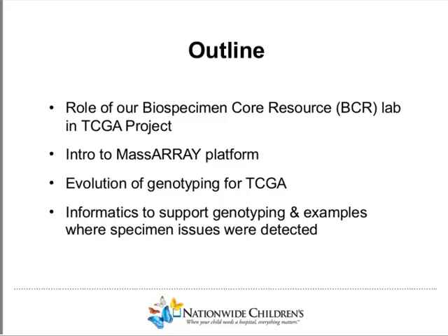I'll briefly give you an introduction into what our Biospecimen Core Resource is and provide the context of our group within the larger project that's known as the Cancer Genome Atlas, or TCGA. I'll then give a brief intro on what the MassARRAY Platform is, for those who are not already familiar with it. And then I'll talk about how we use that platform to perform the genotyping that we did for TCGA, both as an example of working with an existing panel as well as being able to customize a panel over time as your needs evolve.